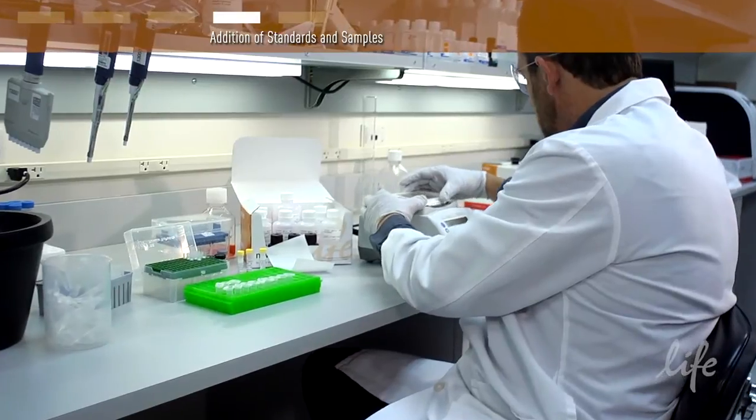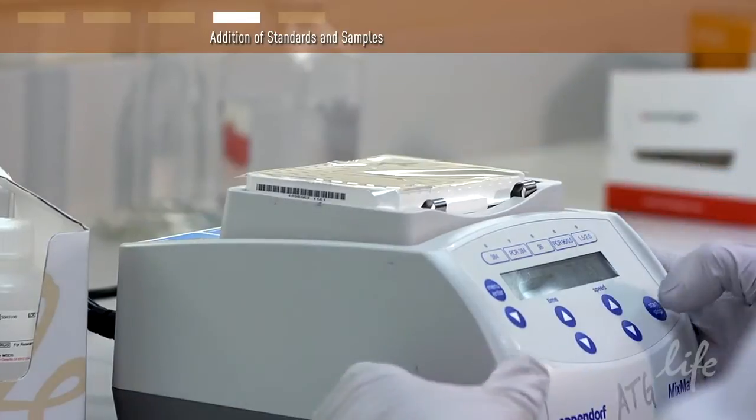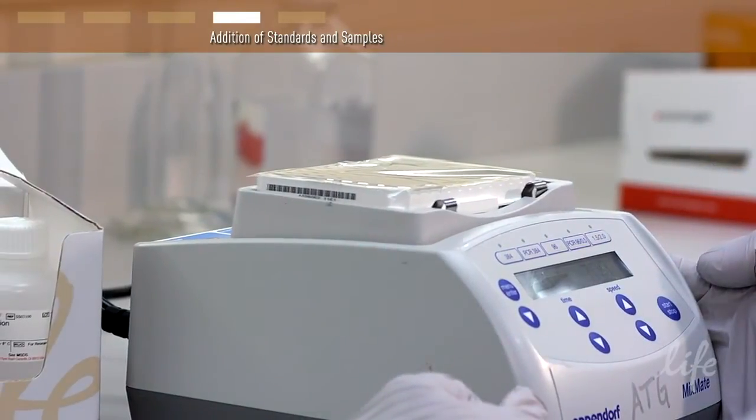It is important to note that in some protocols the samples or standards are co-incubated with a detector antibody.